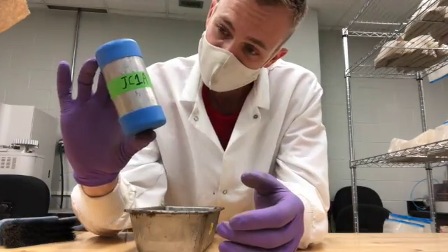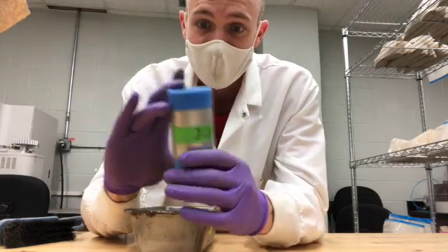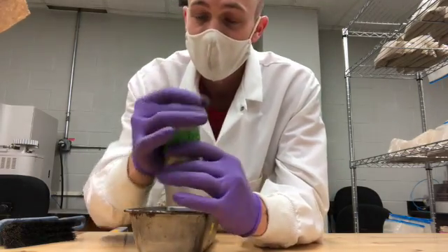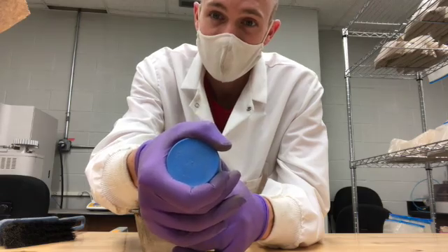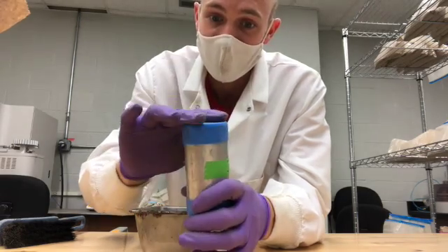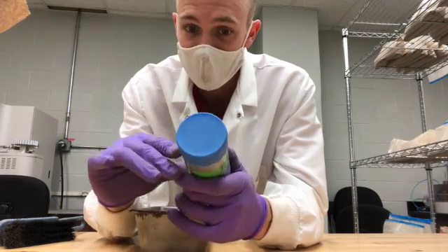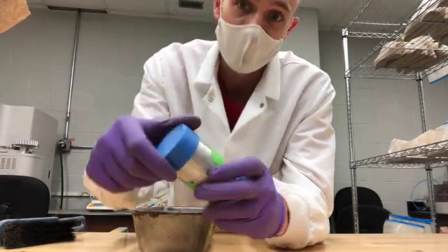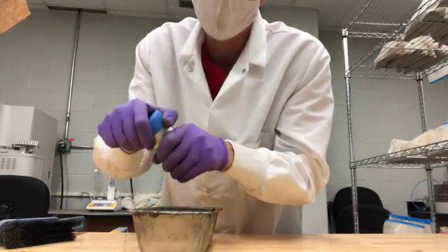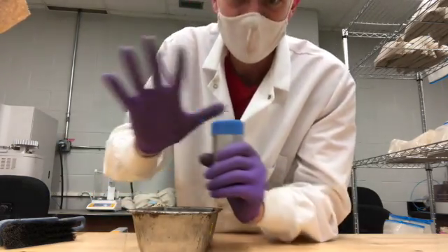Here's my bulk density core. It's 10 centimeters long and five centimeters in diameter — so it's a five-by-ten cylinder full of soil. That core goes down into the ground, you pull it out, and this is what we're going to be sampling the bulk density from.